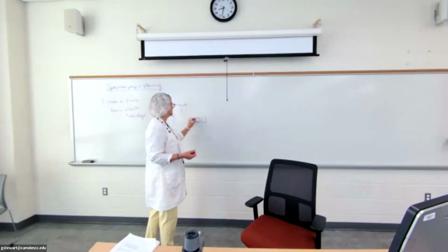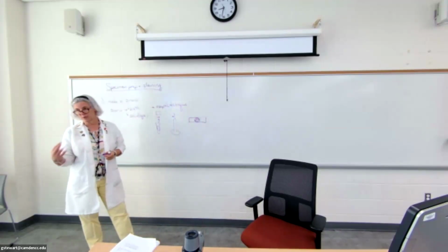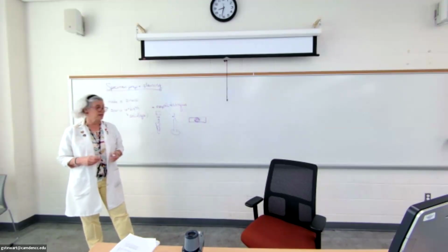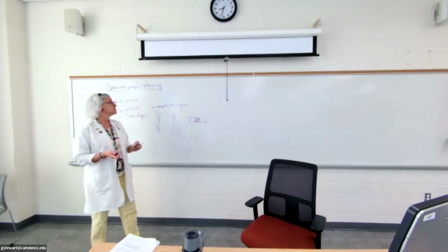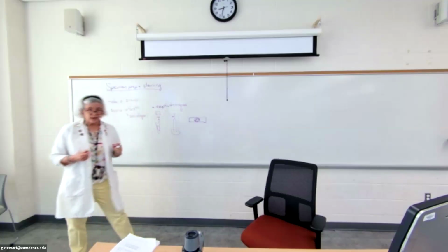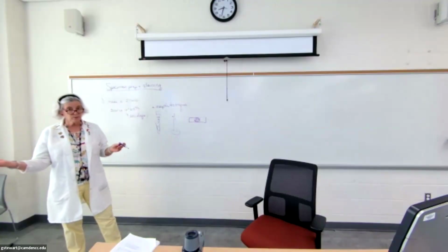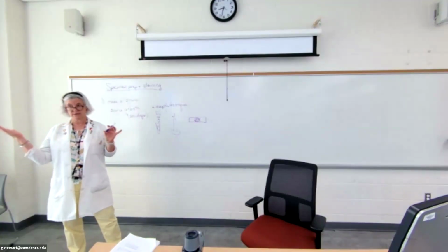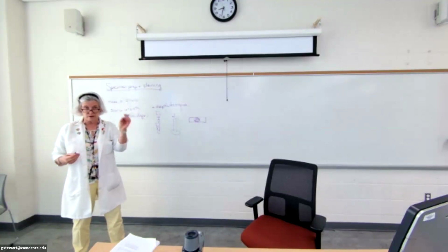I'll even draw the wax circle for you, and we're just going to smush it around. Ideally, we would like that broth to be slightly cloudy when we put it on our slide, which is why I asked you guys to take 3 to 5 loopfuls to get enough on your slide so that you could see it, right? Based on your experience from Tuesday, when I hand you the next broth, you may think, well, I'm going to put 5 to 10 loopfuls on because I didn't see diddly squat, right? So that's kind of up to you as the end user of the broth.